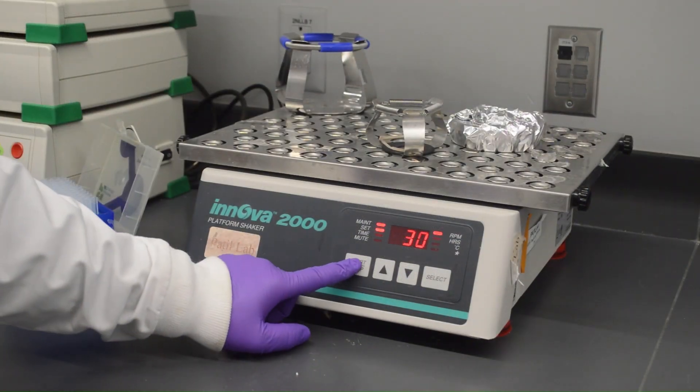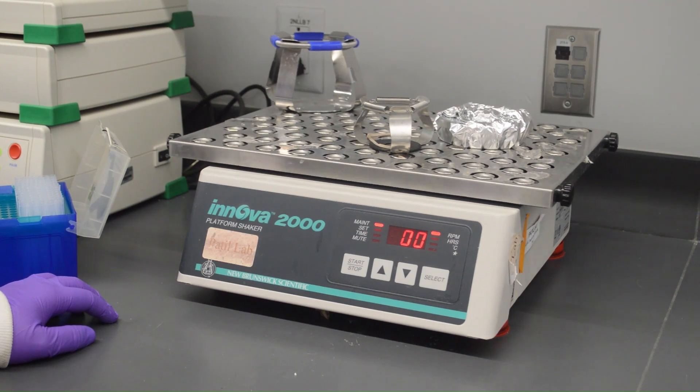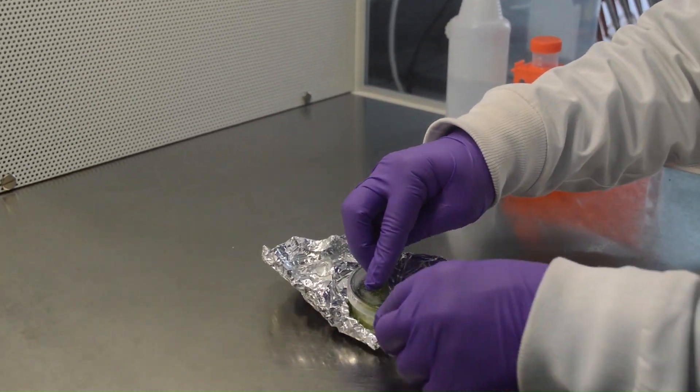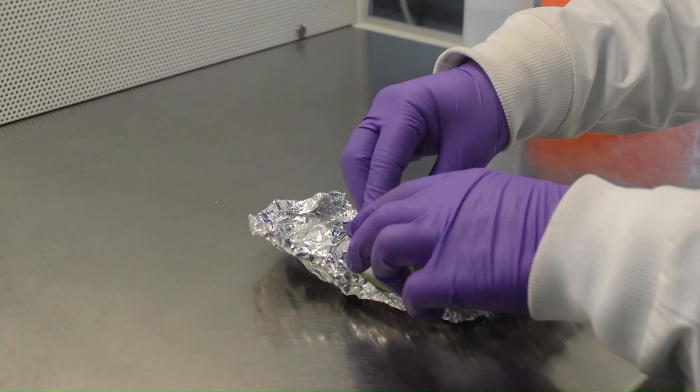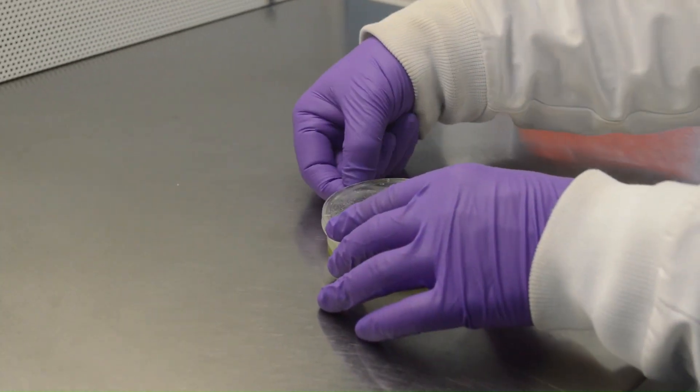Shake the plate in a shaker at room temperature for 3 to 4 hours at 30 RPM. After shaking, the leaves should be completely digested and you should see bleached transparent leaf pieces floating on the media, and the media should look green.